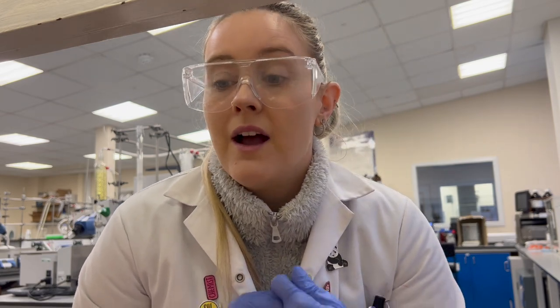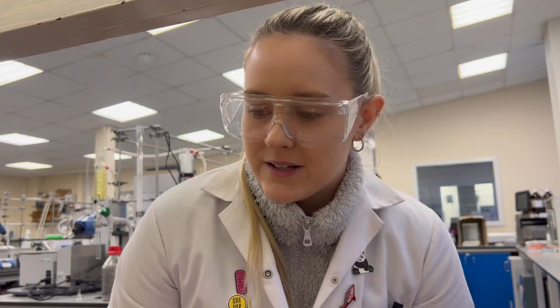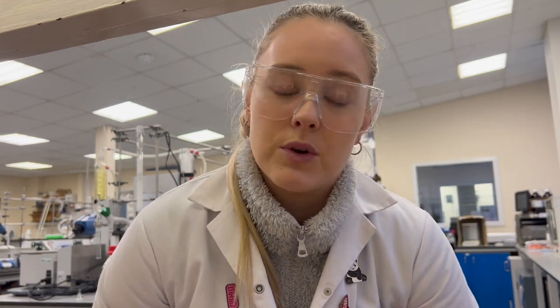So yesterday I extracted the coral, as you saw, and then I used one of the computers here to analyze the LCMS data from the negative ionization mode. Thankfully, we have some good data for some more of the extracts that I am analysing in one of my chapters, so that is good. I can now finish with that LCMS analysis, which is really good because I don't want to be doing too much lab work, as I've mentioned.